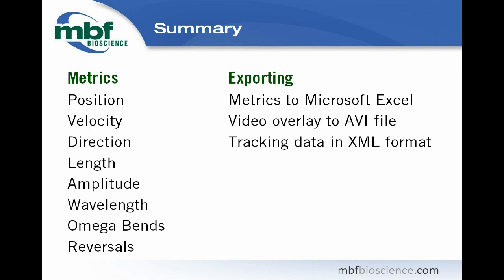The data that we're capturing, we also save in an XML format. So if you're interested in developing custom analyses, the position of the worm in each video frame is saved in XML, and you can import those into other pieces of software, things like MATLAB and so on, and create your own analyses. We talked a little bit about reversals and why reversals were important.